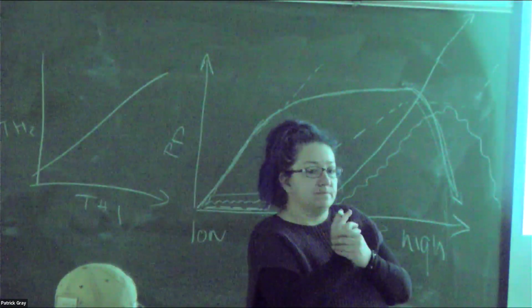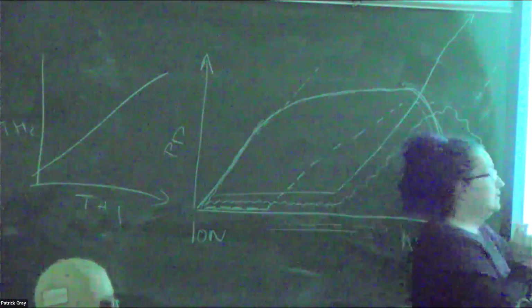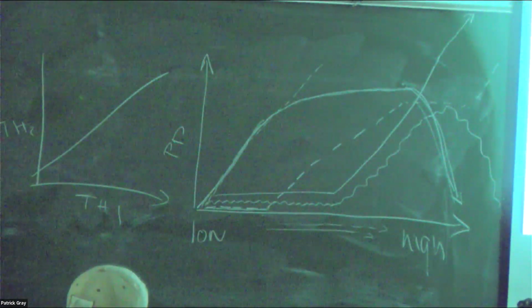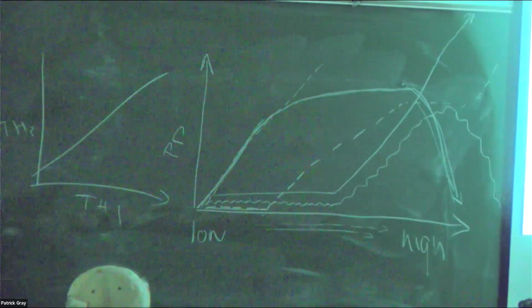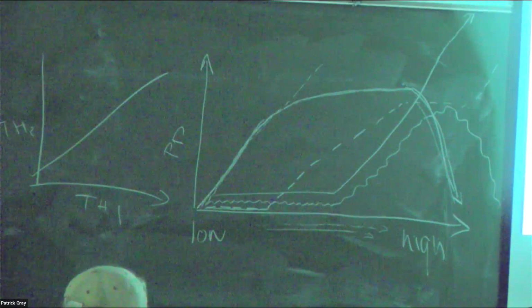So where along that graph does the eco sensor measure? Fluorescence? Where do you think it measures? I guess it depends on how strong the light is and how long it's been on. And also it depends on the light history of the cell. Yes. So today two groups are going to measure cultures.